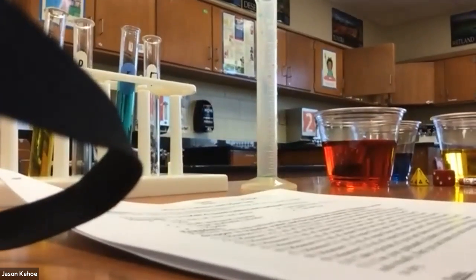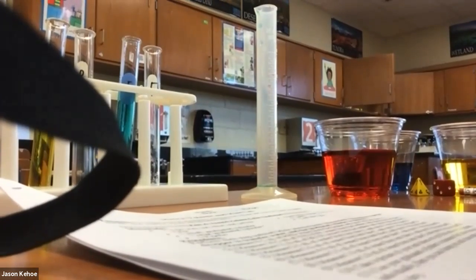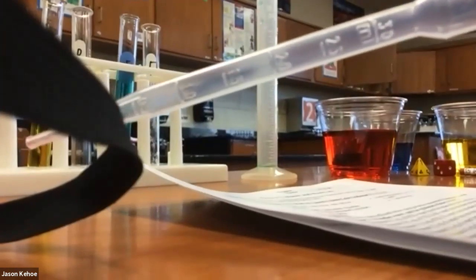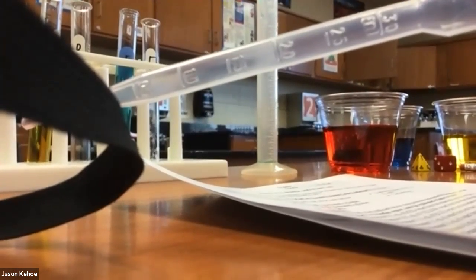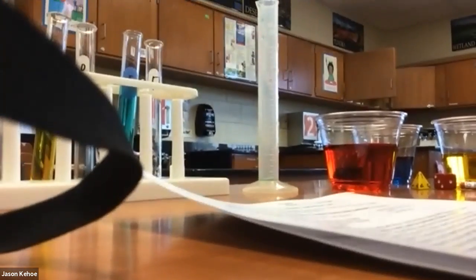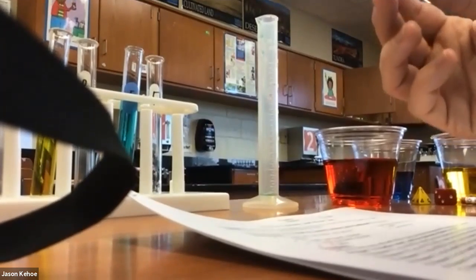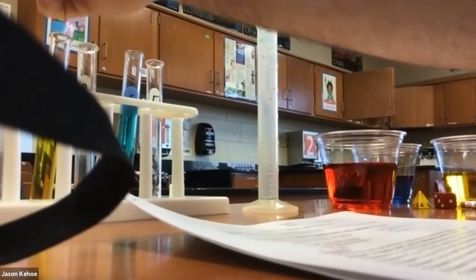So step 4, measure 2.5 milliliters from test tube A and put it into B. Our pipettes can actually be used to measure. You can see here, they have markings for half a milliliter, 1, 1.5, 2, 2.5, and 3. So that makes measuring these small amounts a little easier. So 2.5 from A, from our red one here.